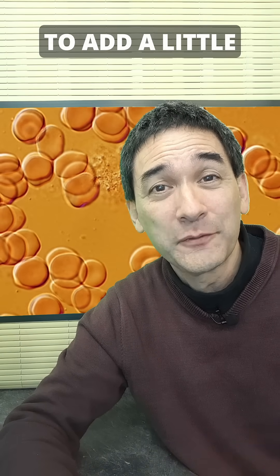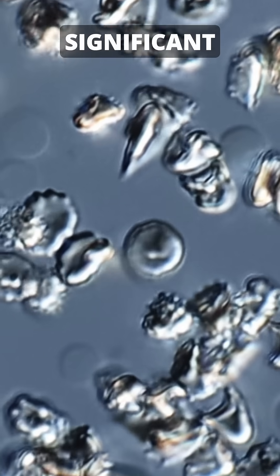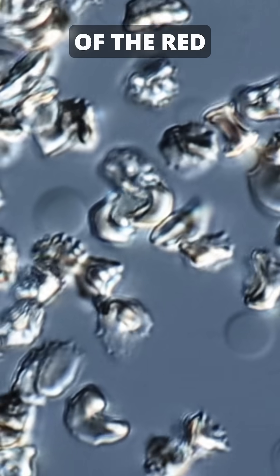But now I'm going to add a little bit of salt water — concentrated salt water — and this has a significant impact on the appearance of the red blood cells.